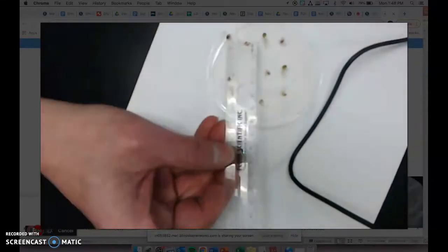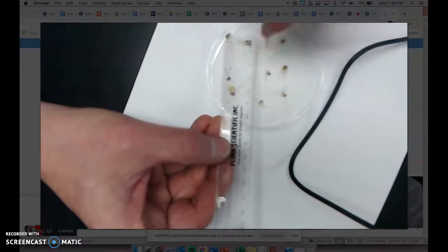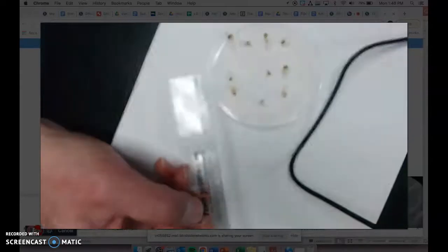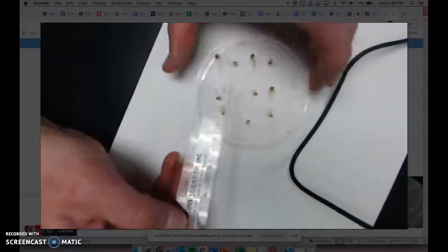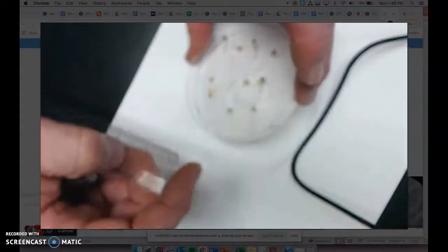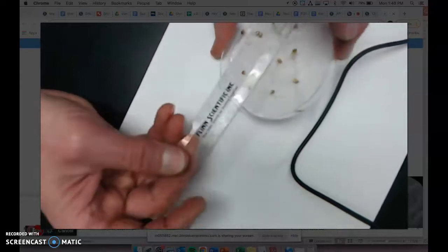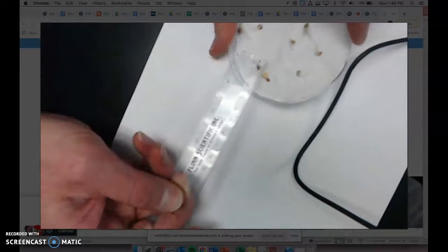They're not quite as healthy of roots as our control. And to measure the roots, all we're going to do is measure their length. So this one, taking into consideration that it's curving around the corner, is probably around 2.9 or 3 centimeters. This one, where's another good one that I can find? See, that's part of the problem, it's sometimes kind of difficult. How about this one? That one's also about 3. This one over here is about 1.